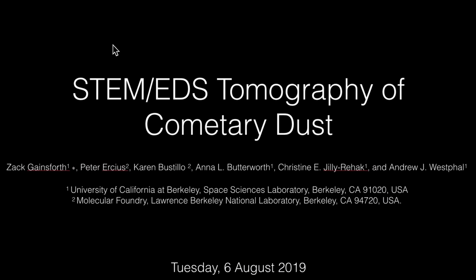This is a talk, and a lot of the data is pertinent. My plan is to go through the basics from this talk, but also to walk you through doing an actual reconstruction using the software, and also the acquisition. I have some video footage of using the TitanX microscope at the National Center for Electron Microscopy, showing you how to actually acquire these data sets.